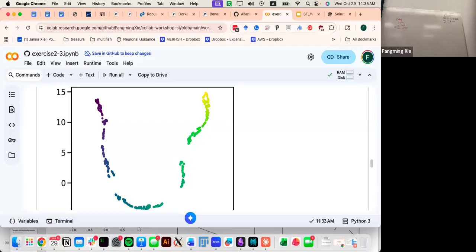I see. And then this is now running because I just copied yours. Yeah, because you see usually there's one line that's heavy lifting. It's this one. You see fit transform takes quite a long time.